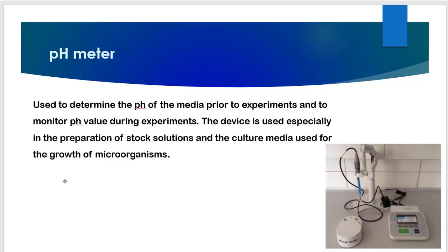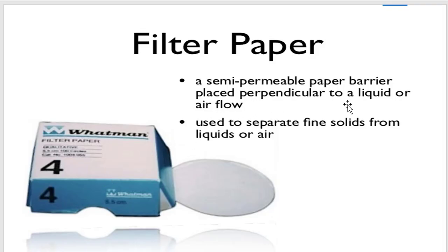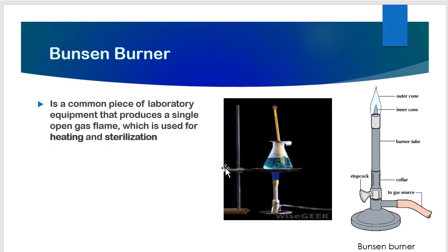Next we have the pH meter. With this equipment we measure the pH of a solution to determine whether it is acidic or basic. This is an electrode-based pH meter and it gives a digital reading — very useful in any microbiology laboratory. We also have filter paper, which is a semi-permeable paper barrier placed perpendicular to a liquid or airflow, used to separate fine solids from liquid or air. We also have the Bunsen burner, a common piece of laboratory equipment that produces a single open gas flame used for heating and sterilization. We keep the Bunsen burner inside the laminar flow hood to sterilize our environment and our inoculating needles and spreaders.